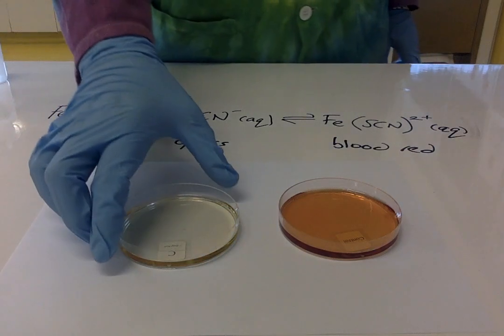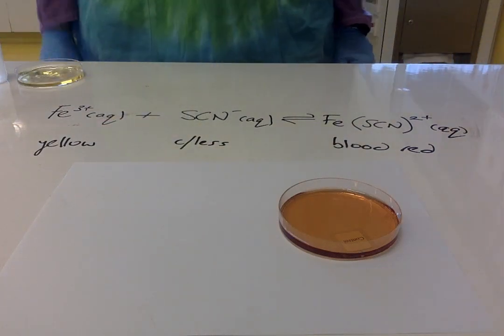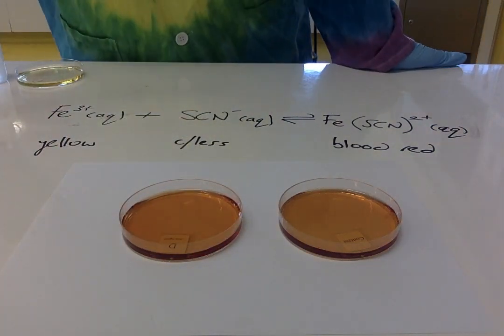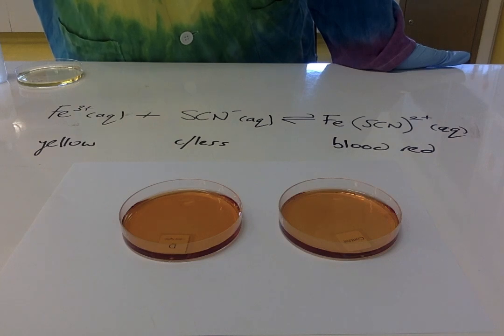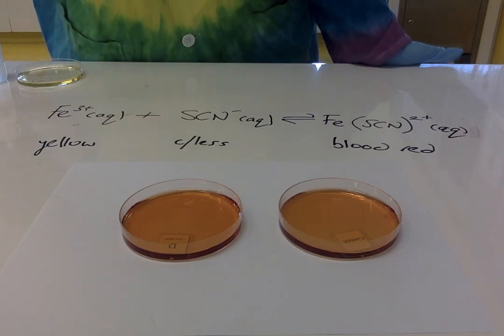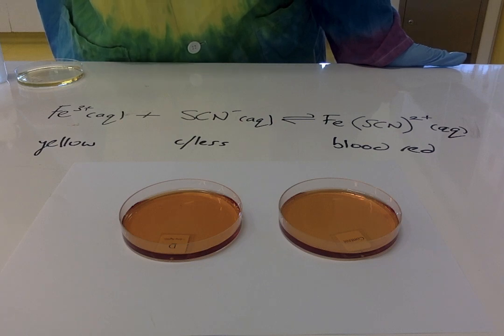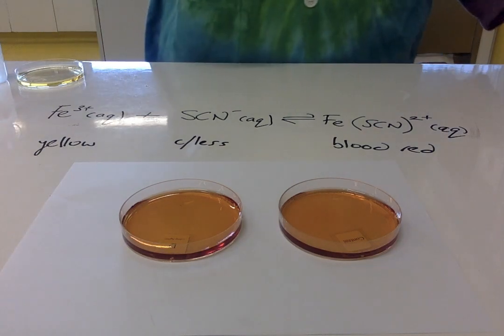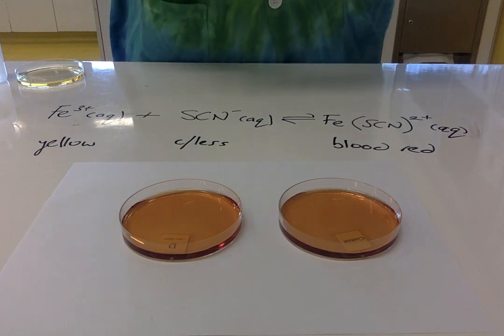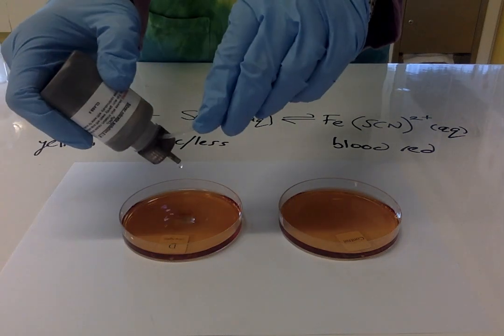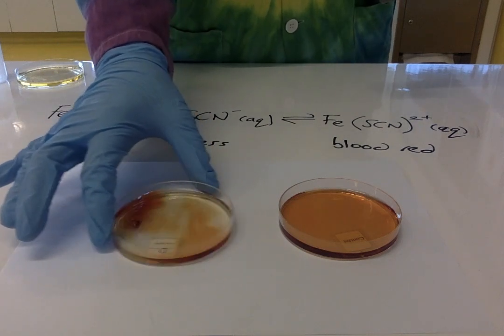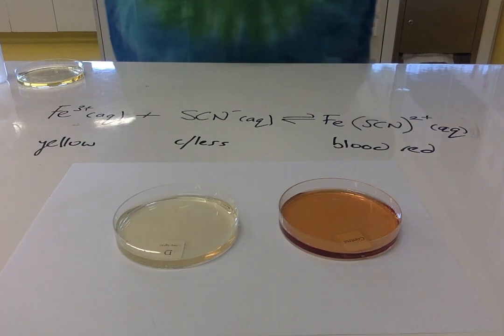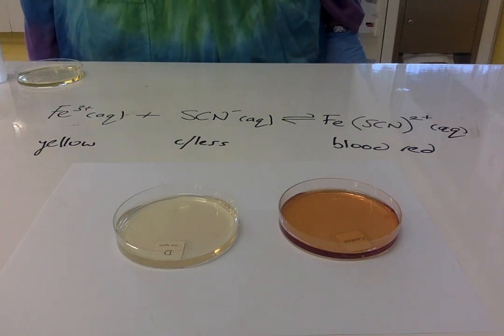The next one I'm going to be doing is to add some silver nitrate. As you can see in your notes, silver nitrate decreases the amount of thiocyanate because silver ions react with thiocyanate ions to form a white precipitate of silver thiocyanate. So if we remove the thiocyanate ions, again it's gone completely colored—like a tinge of yellow in there—but there's a distinct shift to the left.